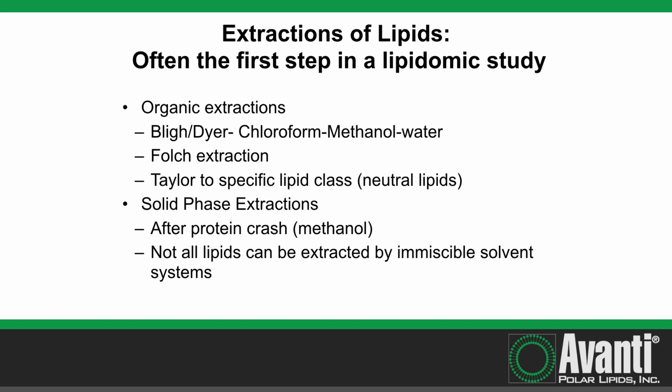I might also point out at this point that not all lipids can be extracted by immiscible solvents. Some people think that's the hallmark of the definition of a lipid, but it is clearly not. There are lipids that we've spent a long time studying, for example, leukotriene C4, which cannot be extracted out of an aqueous system using an immiscible solvent like chloroform methanol. You must use solid phase extractions to isolate that particular lipid from an aqueous environment.